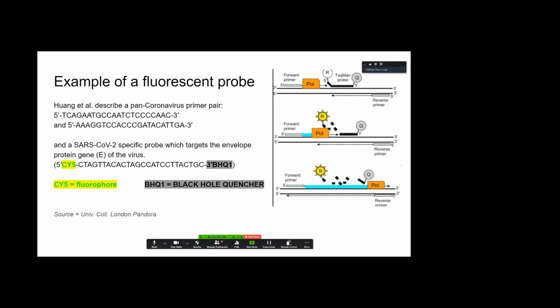And as the polymerase starts chugging along, when it reaches the TaqMan probe, the polymerase itself starts chewing up that 26 base nucleotide. I'll just call it a DNA sequence. That's probably the best. So the polymerase, when it gets there, starts chewing it up. The C comes off first, the T comes off. It just cuts it as it's going along, saying, get out of my way. I'm trying to recopy the entire DNA, get out of my way.